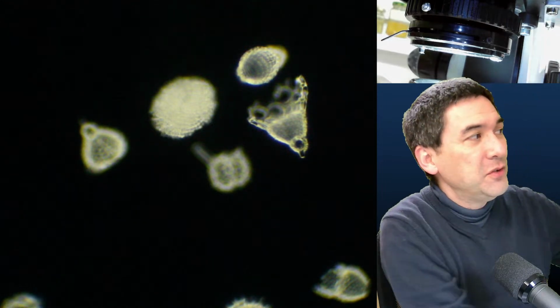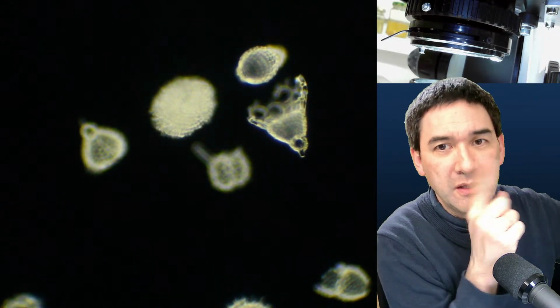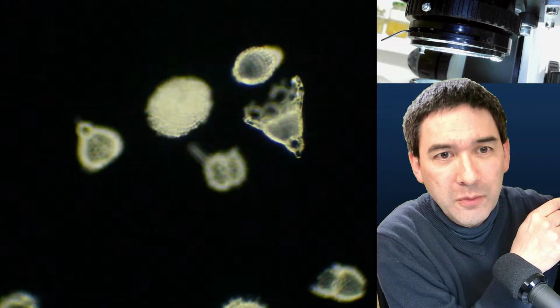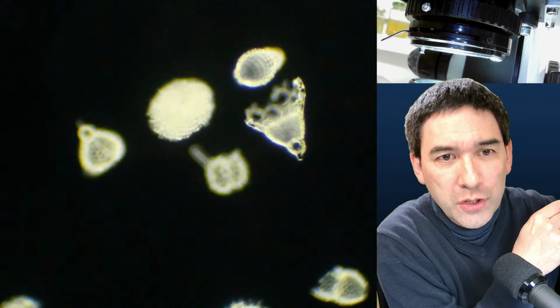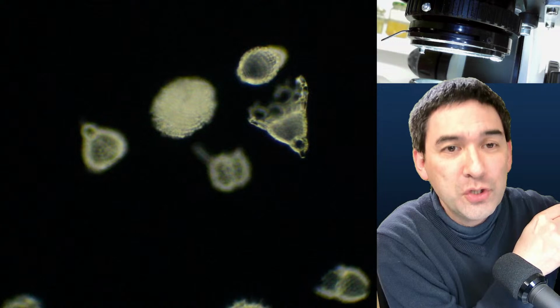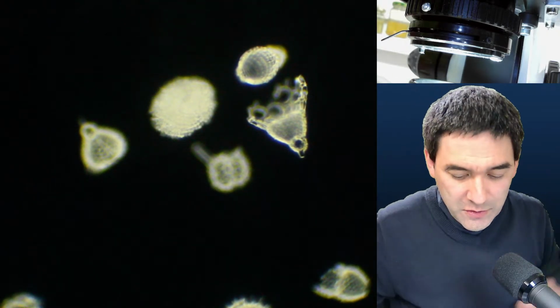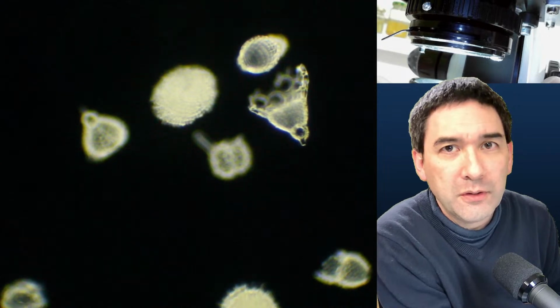So look what I can do. Just watch what I'm doing. There's a little wheel on my DSLR, and just by turning the wheel, I'm quite easily able to adjust the brightness of the image, and that's the reason why I've actually connected the DSLR camera. So it's really for convenience.